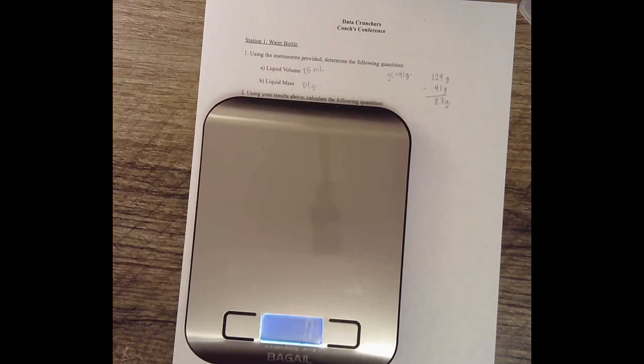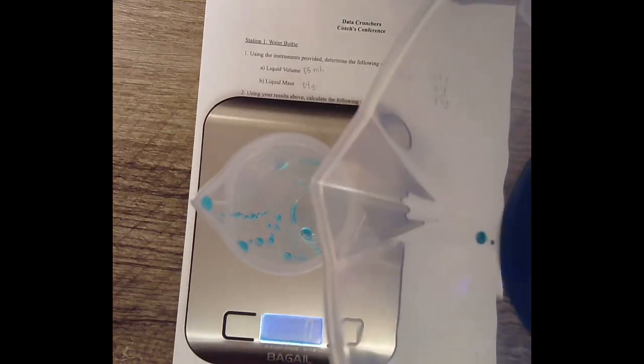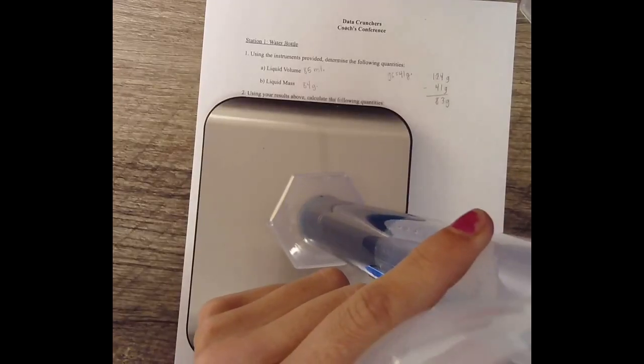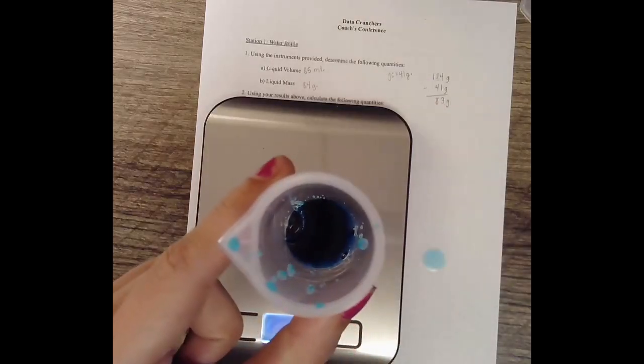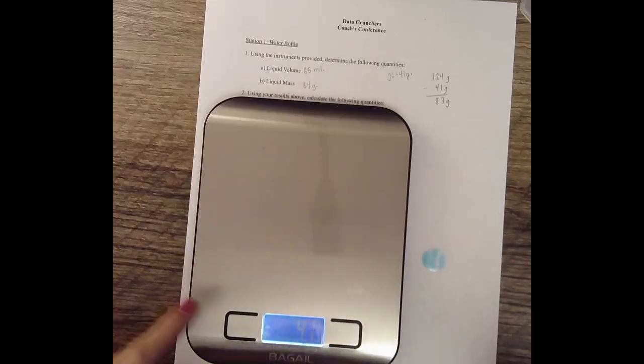Let's see. 41 grams. Oh no, I contaminated the paper, y'all. 84 grams. We still got the same thing.